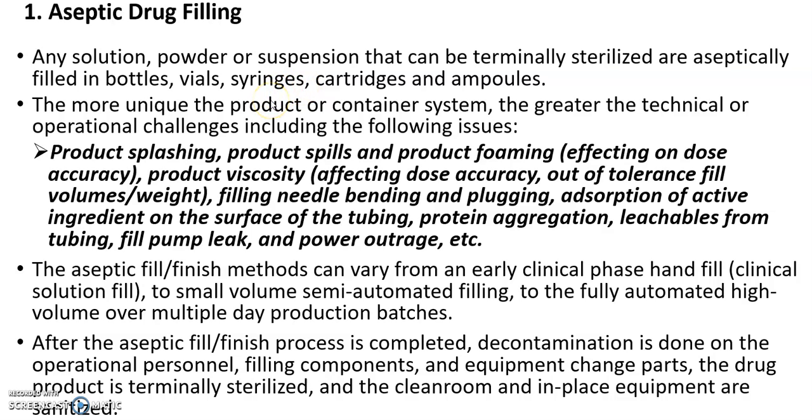Okay, so in a lot of cases it's done automatically because there are automatic machines that can do that process, although those are very expensive. But whichever way you do it, there are a lot of difficulties. Those are engineering difficulties that you will be facing. The issues are: how do you make sure that the accurate dosage will be filled in a vial? Depending on the viscosity of the product, it may be hard to push that liquid into that vial. So the dosage accuracy is a problem.